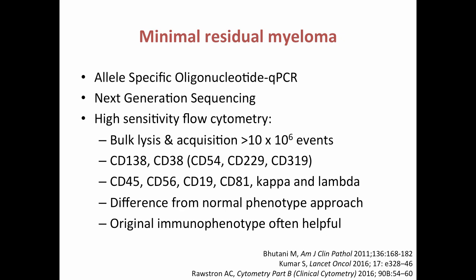Although CD38 and CD138 are useful antigens for the detection of plasma cells, their utility in the lab may be limited if the patient has received monoclonal antibody therapy directed against those antigens. Therefore, there is ongoing investigation for alternative plasma cell markers, such as CD319.